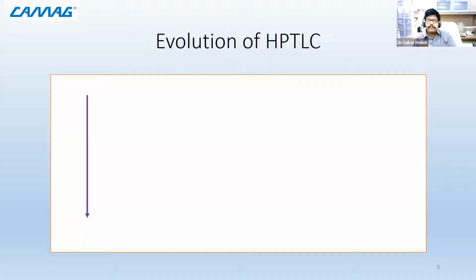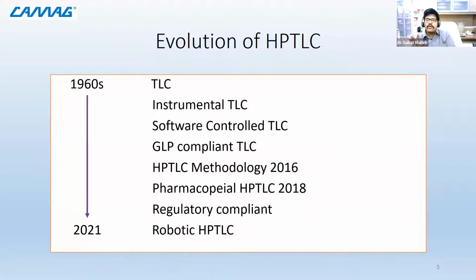And why is this approach important? Because when you are going for research of a high grade level, you want output of a high grade level, you need to have very good standardization. Now let me show you the evolution of TLC to HPTLC.